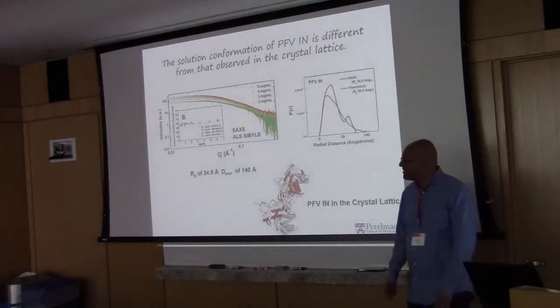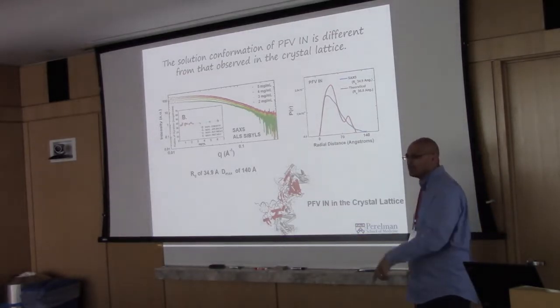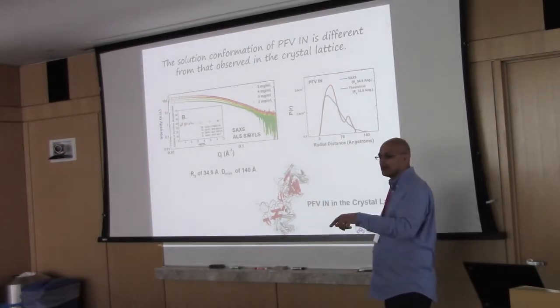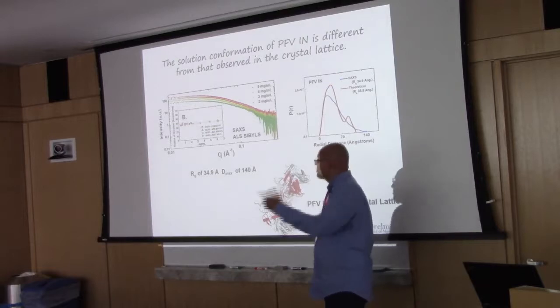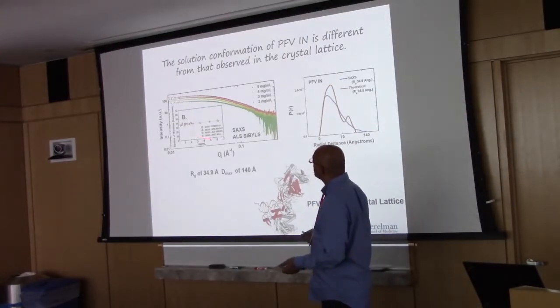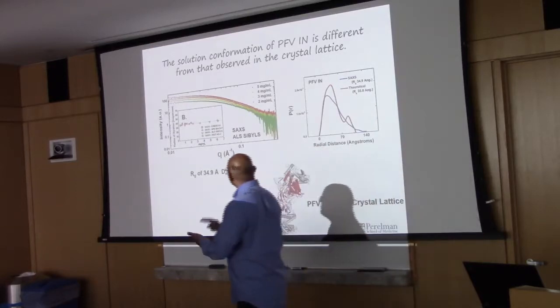Okay. And so what did I do? Someone asked a question: how many synchrotron trips did you take to solve this? And so in each of these stories, I'll make a mention of how much I actually scattered it. We have a home source, and alongside that I'm frequently going to synchrotrons to make measurements. This is the protein I took along. I just scattered it everywhere I could. I mailed it into ALS. I took it here to CHESS.